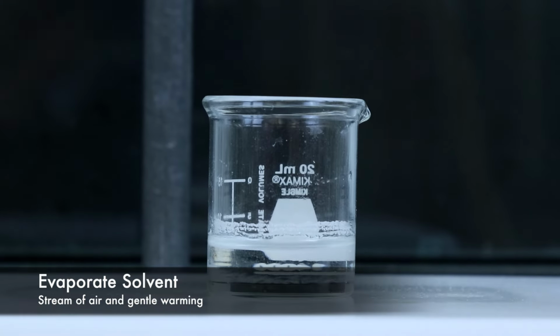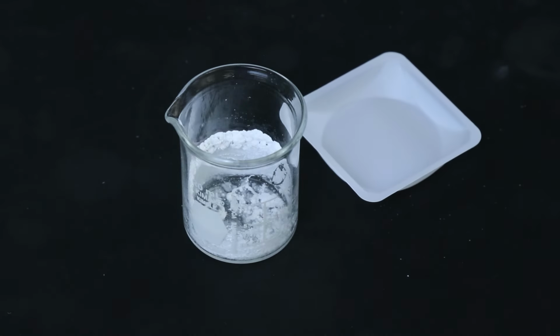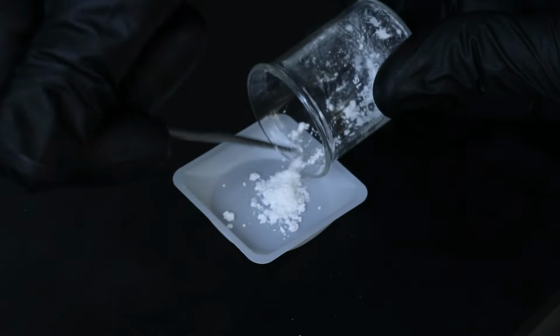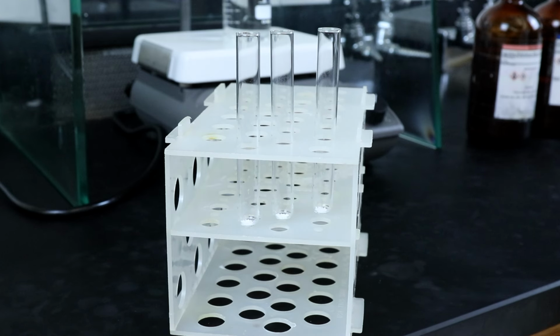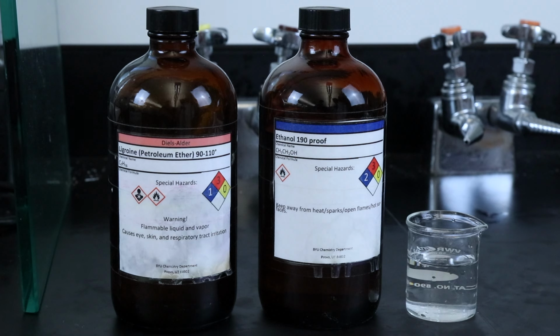The methylene chloride solvent can then be evaporated using a stream of air and gentle warming, and this is what the crude alcohol ends up looking like. I'll gather it so I can begin the recrystallization process, separating a small portion of it into 3 separate test tubes in order to test out which solvent is going to work best for recrystallizing this unknown alcohol. Here are the three solvents that I'll be testing. I'll try ligroin, 95% ethanol, and water, and possibly also an ethanol water mixture.